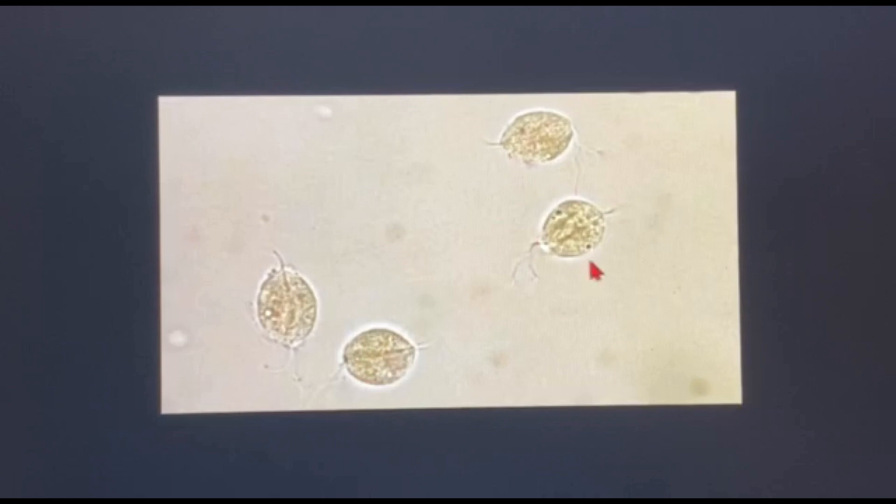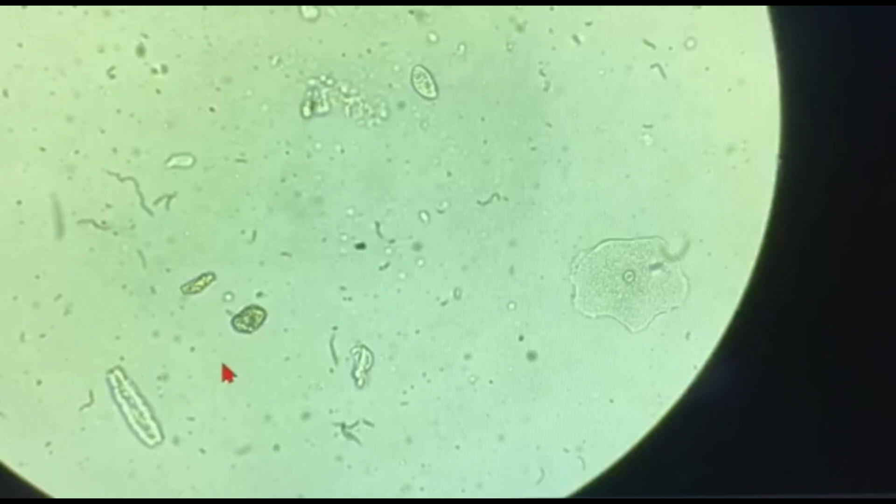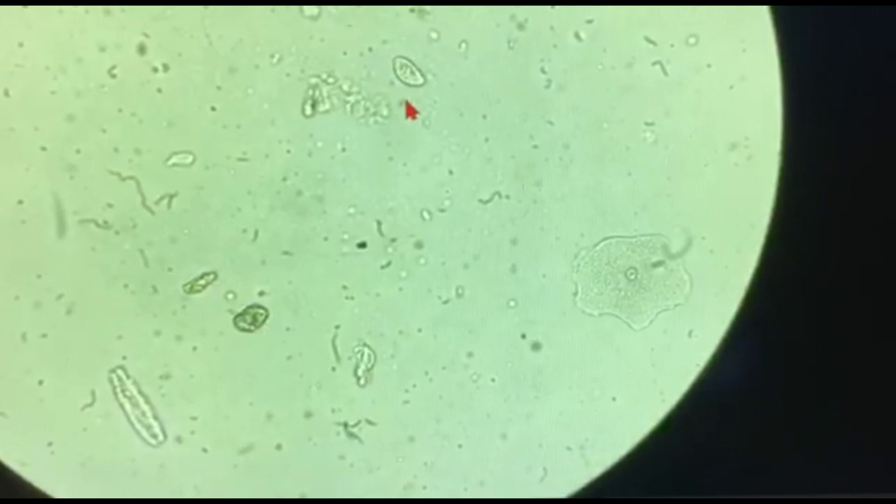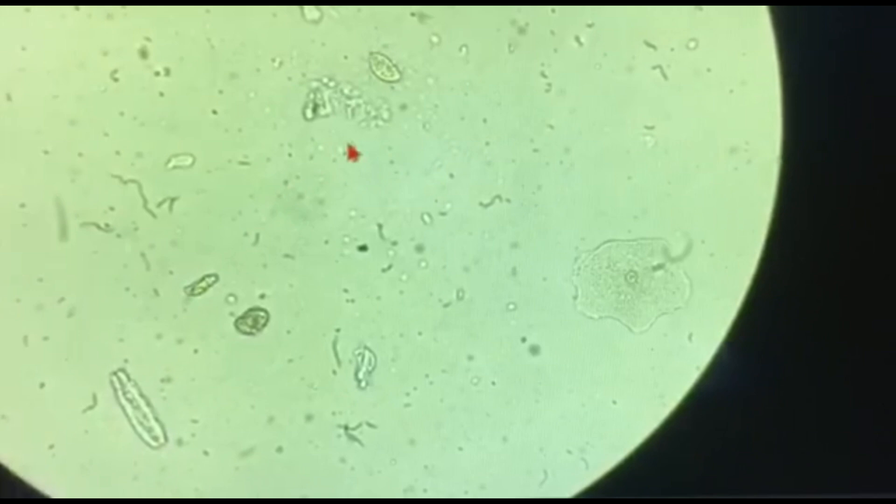Now this is a video of Trichomonas vaginalis that I had taken. This is a wet mount of a urine sample. Observe the jerky movements done by the protozoa. Let me run it again. Can you see the flagella at the top? If you see it properly you can see a very thin faint flagella that comes up there.